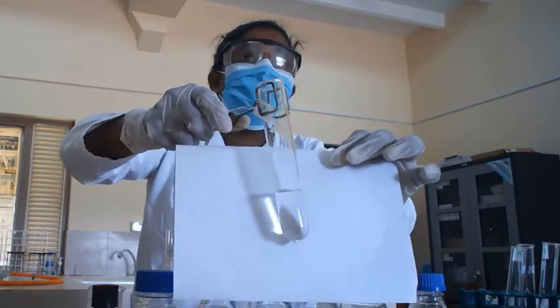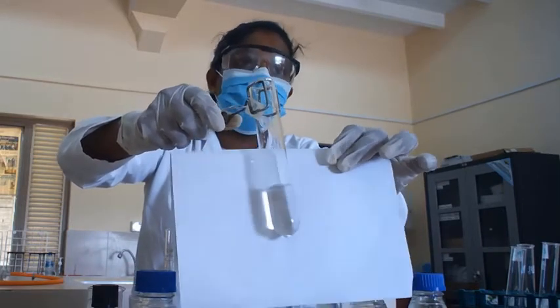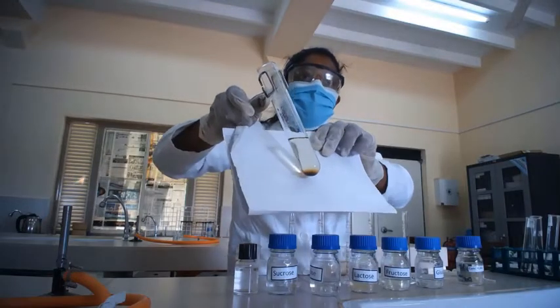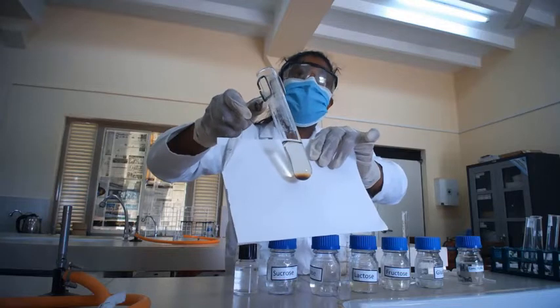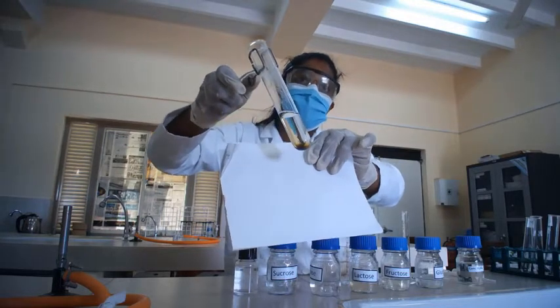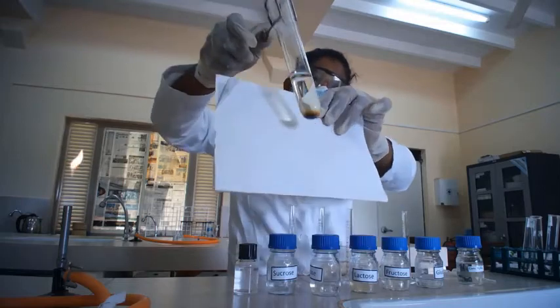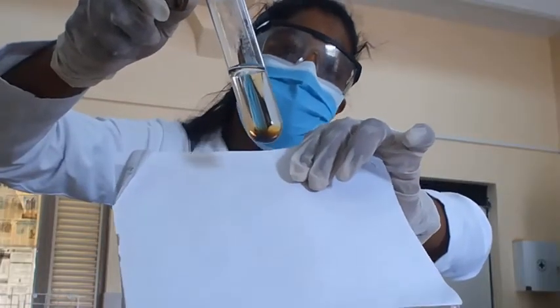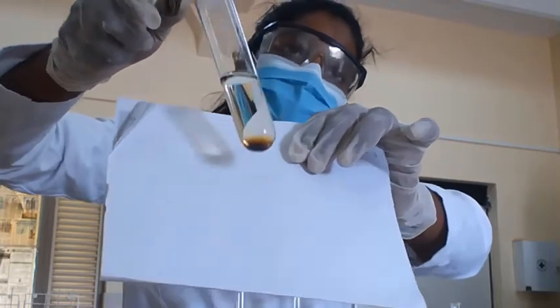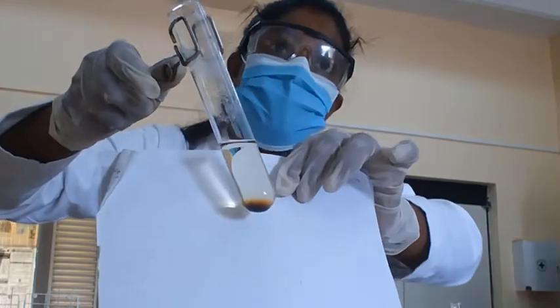Now we are going to see what will happen if we add more sulfuric acid to the solution. Now you can see what happens when we add more sulfuric acid. In here the solution has caramelized. You can see that there's a brown color patch at the bottom of the boiling tube due to the caramelization of the sugar.